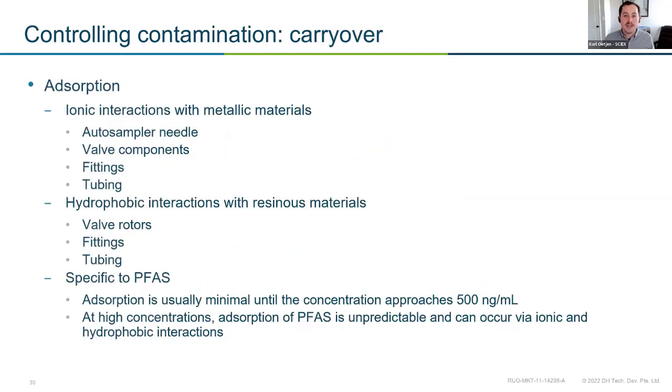So besides just contamination, the other issue that we face in the lab a lot is carryover. And carryover can be a little bit trickier, and it's going to depend a little bit on what type of analysis you're doing. So for example, we might be having some ionic interactions with metallic materials.